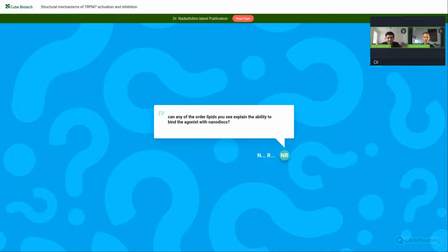Okay, great. Thank you. The next question is from Nikolai Rupinsky, and he's asking, can any of the annular lipids you see explain the ability to bind the agonist in nanodiscs? Yes, this is an excellent question, and unfortunately, I don't have a good answer to that. What we think happens, and again, this is just my theory, is that the protein is more happy in nanodiscs, probably because the nanodisc wraps around the TRPM7 channel but also leaves some room for regular lipids.